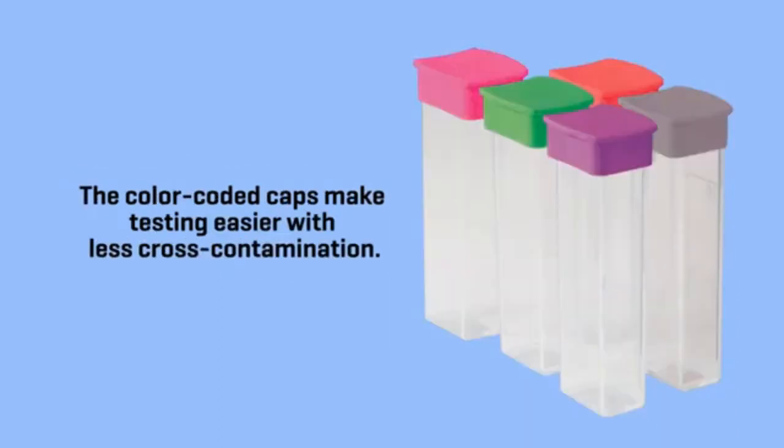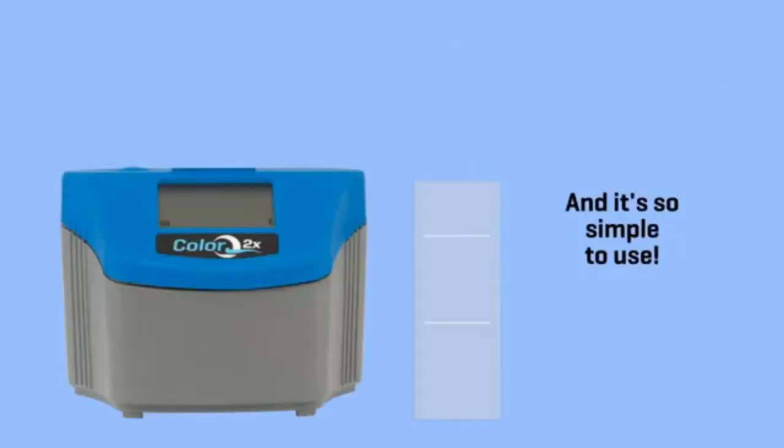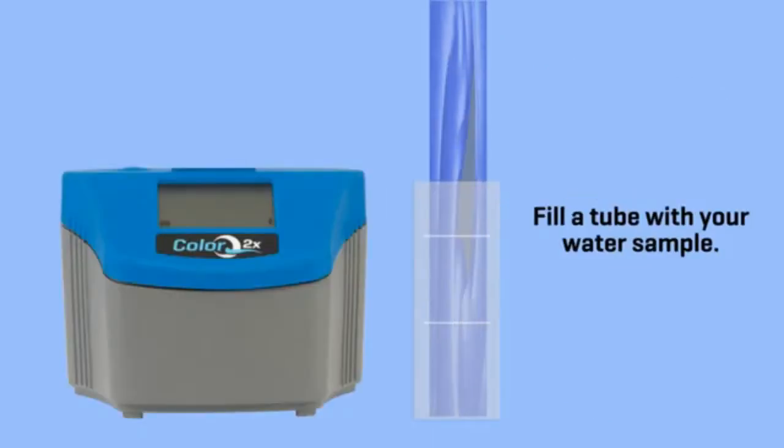The color-coded caps make testing easier with less cross-contamination. And it's so simple to use — fill a tube with your water sample using the color-coded caps.